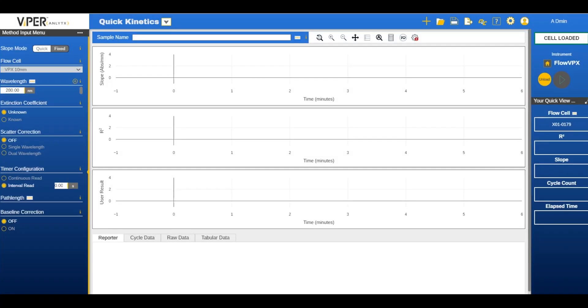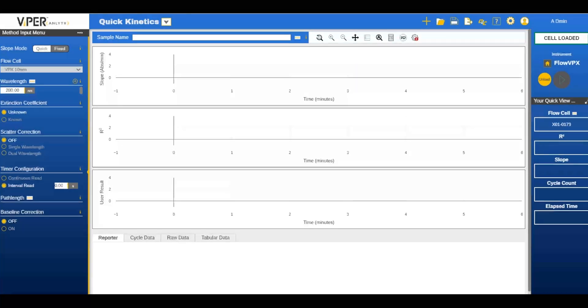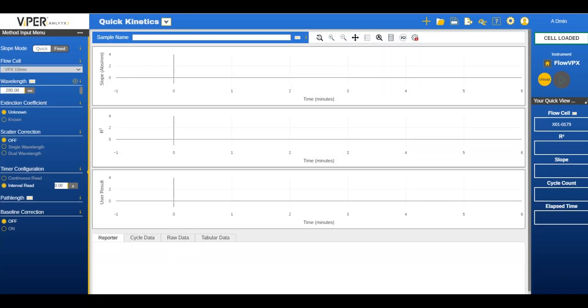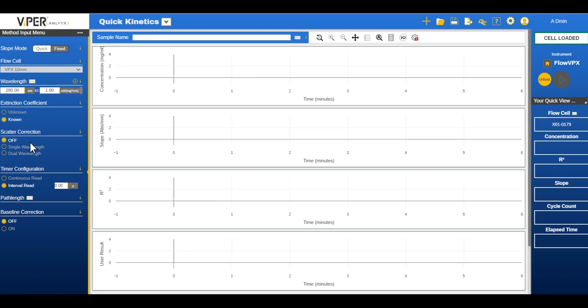Once loaded, the user creates the method. Creating the method is done by inputting the desired wavelengths on the left side of the screen and selecting if the extinction coefficient in absorbance per centimeter is known. The known EC value for BSA is 0.67 so we can input that into the EC field.